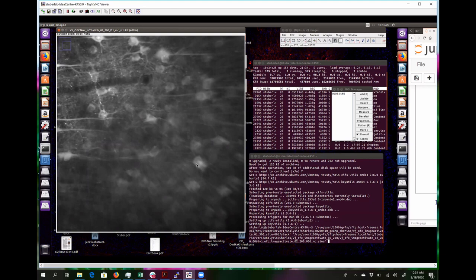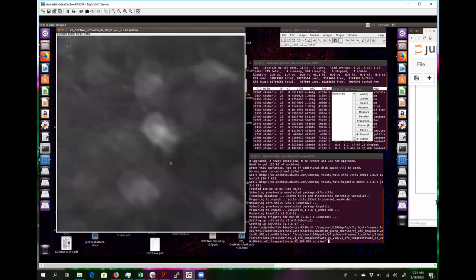Yeah. So for 1 photon imaging, I think the Z resolution is like square root 2, so I think it's like 40% worse roughly than 2 photon. Okay. And so towards the edges here, you start approaching that.